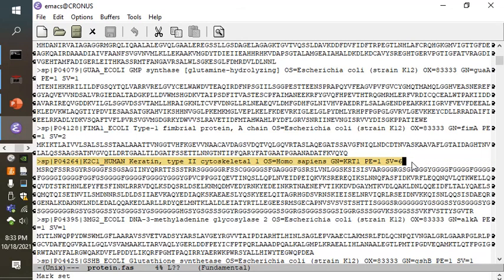Now, how did that get into the sequence database? Remember, we started with a sequence database, a reference proteome for E. coli directly downloaded from UniProt. The E. coli database, as downloaded from UniProt, does not contain keratin. But remember, when we added decoy sequences to our database, we also added contaminants, and that's where keratin comes from. It is not marked with a particular signifier to specify that this came from the contaminant set, but in this case, anything marked _human is definitely going to qualify. If you spot any yeast proteins in here, that would be a similar case, because the contaminant proteins are not just human ones.